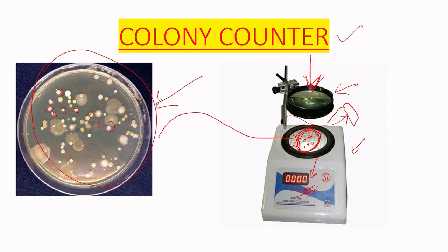This shows how many colonies are present in our petri plate. In this way, the colony counter is performed for colony counting. Next equipment.